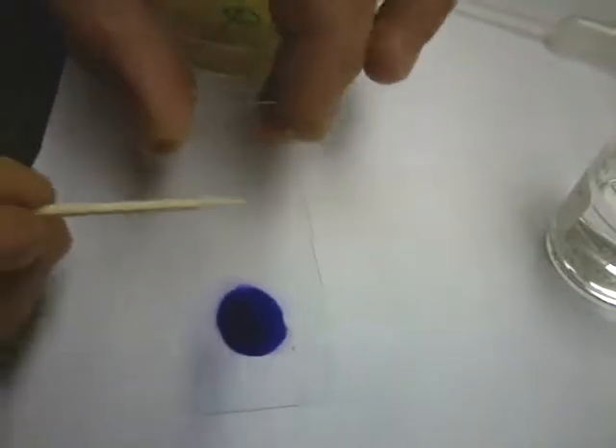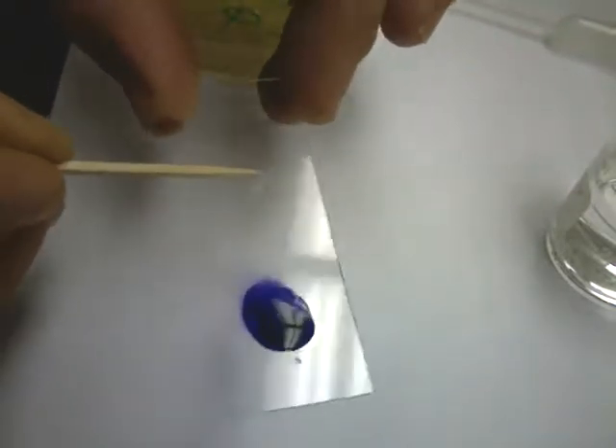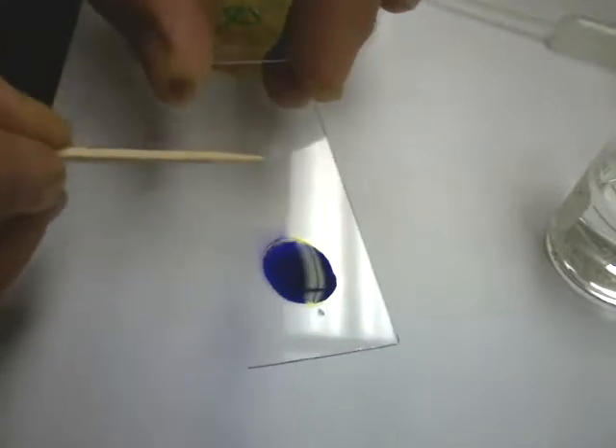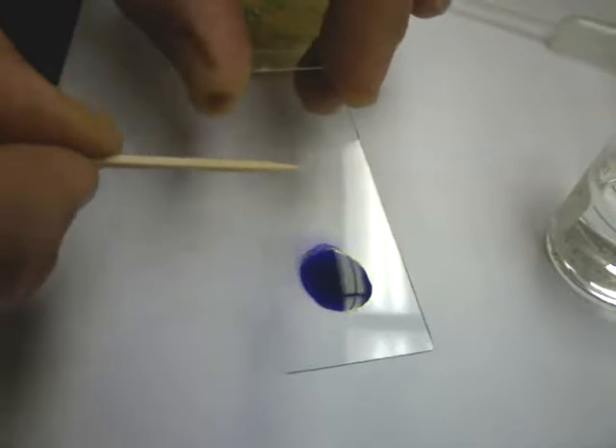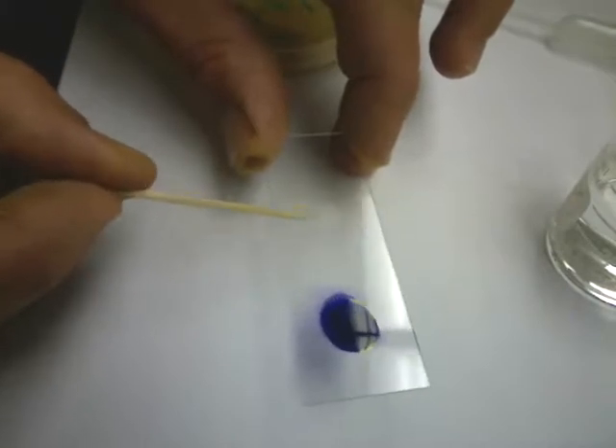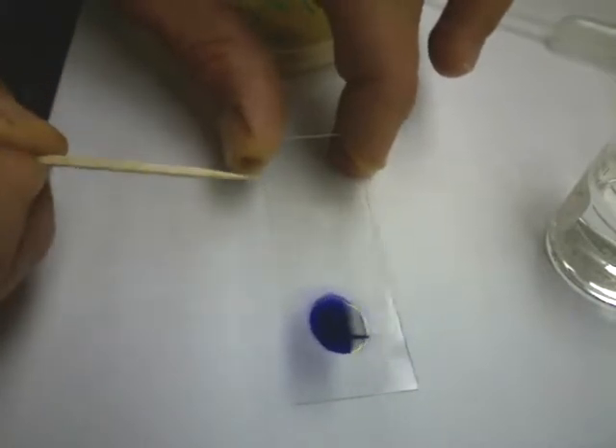Now we're going to spread this tiny amount of material on our slide. I've got a second one running on the slide right now, just so this will go quicker. You put it on there. If it's thick, you can get a little bit of water on a separate toothpick and spread it out some — but not too much water, because it's going to have to dry before we can move on.